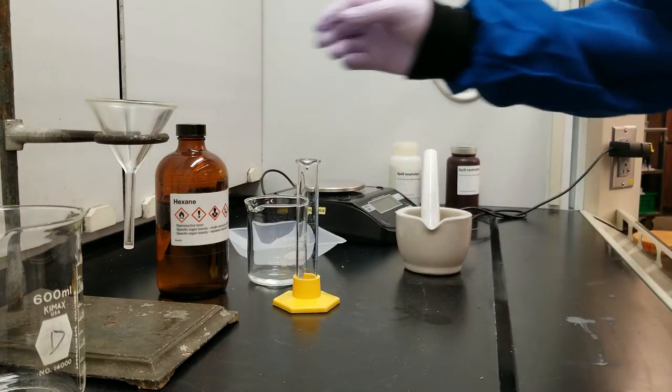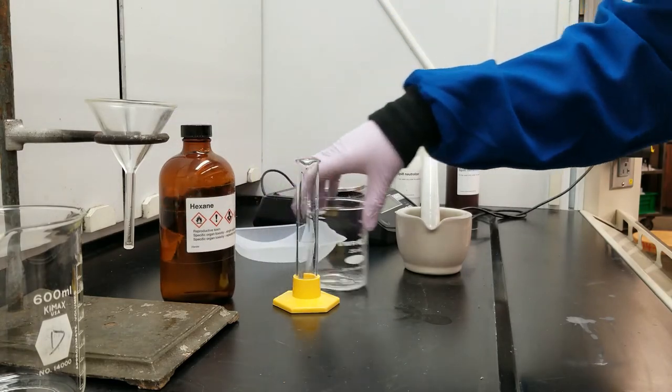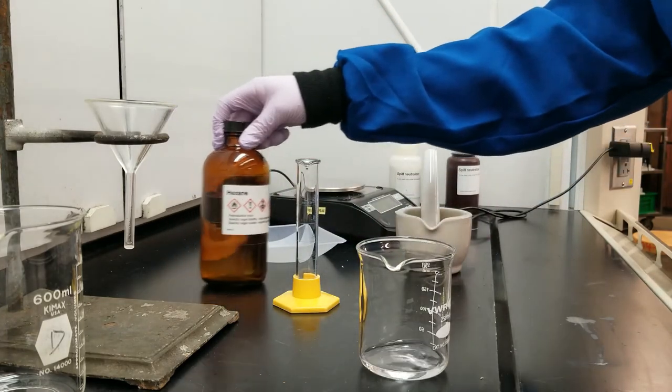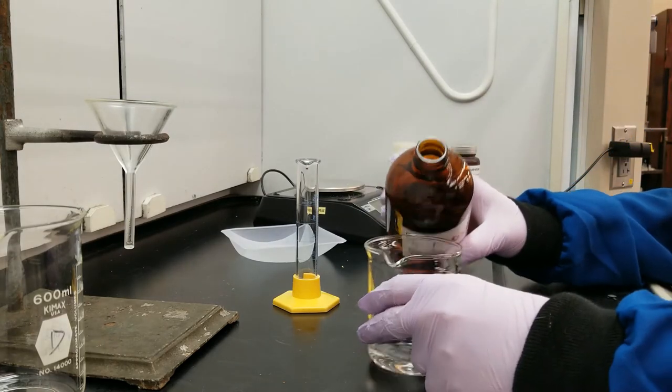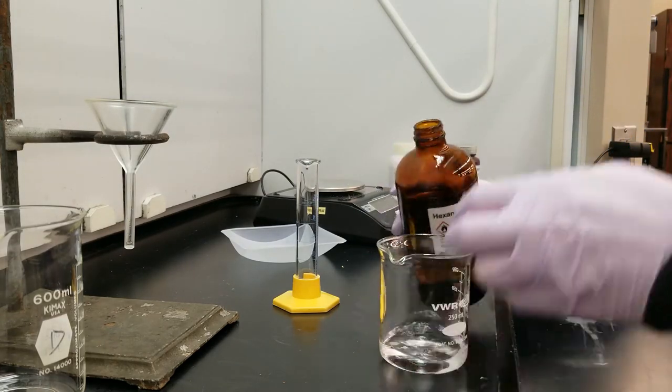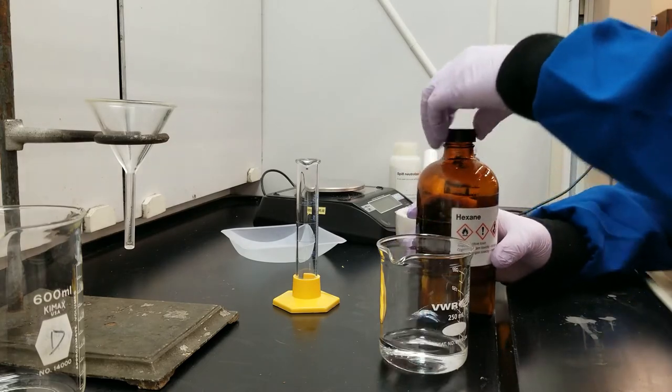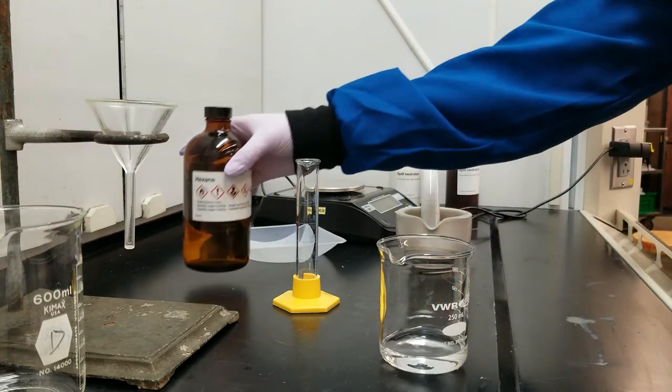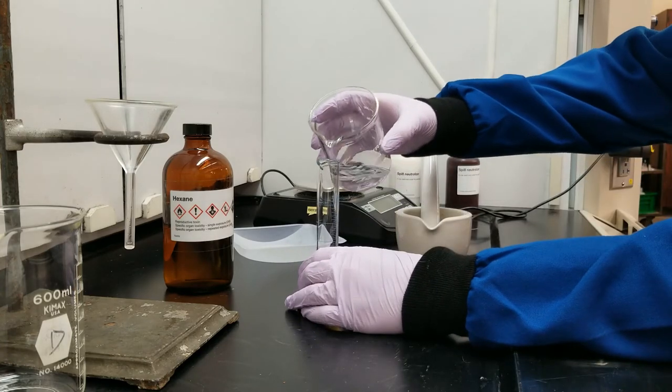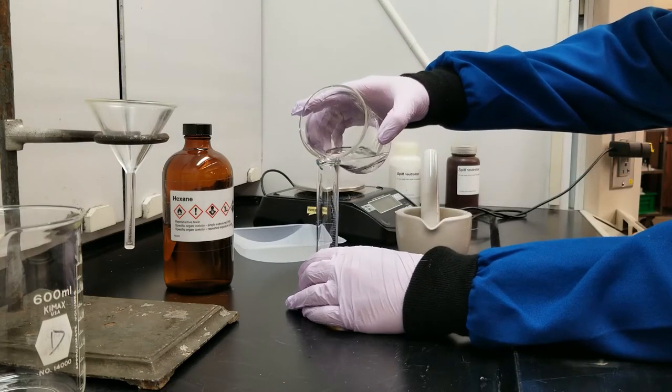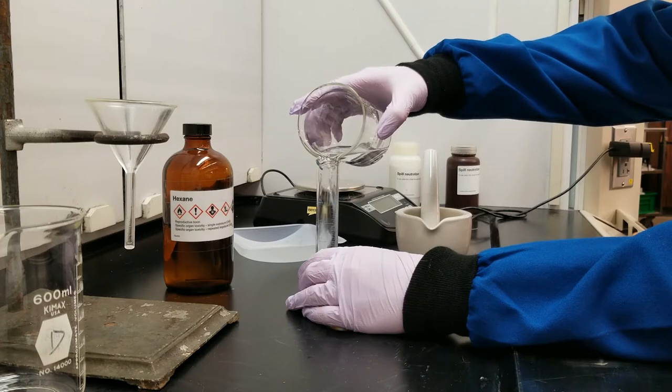My solvent today is hexane, so I'm going to get about 20 milliliters of hexane for my first addition. I'm pouring into a beaker because graduated cylinders are top heavy, and so it's more likely that I tip it over if I pour it directly from the solvent jar into my graduated cylinder.